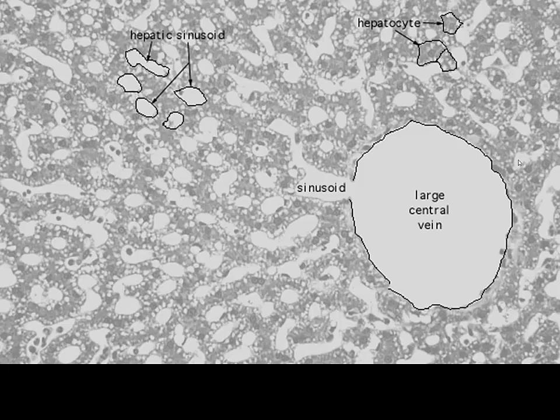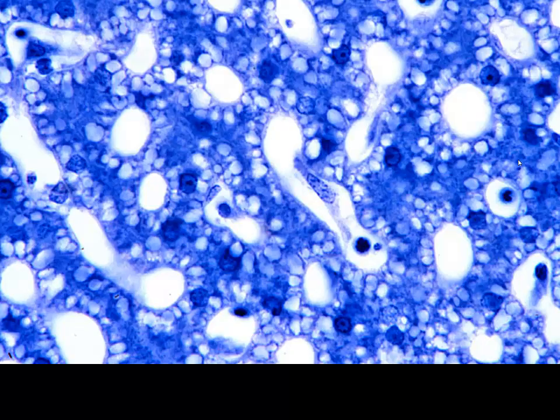Different stains showing a lot of the cholesterol-rich material that the hepatocytes are processing. We can see those as the white spherical structures, and we'll see them as we go up in magnification. Remember, liver cells do quite a bit of processing metabolism of cholesterols, triglycerides, lipoproteins. Once again, it almost looks like goblet cells everywhere, but these are in fact the vesicles that contain this material present inside of our hepatocytes.